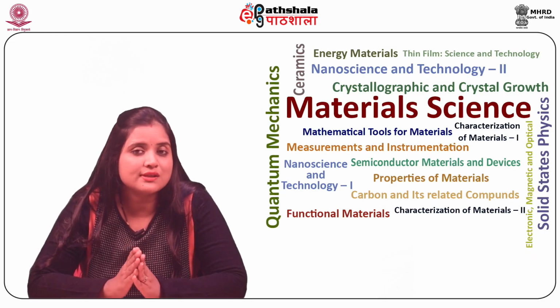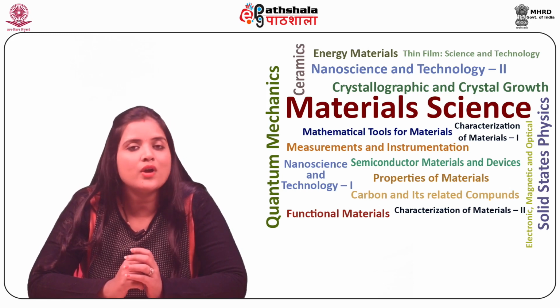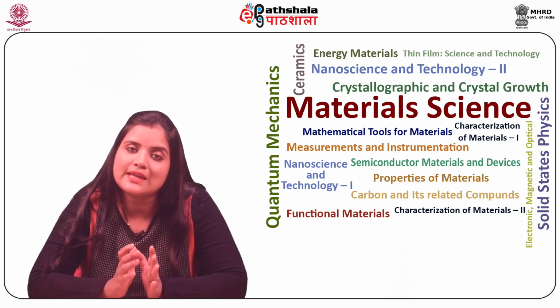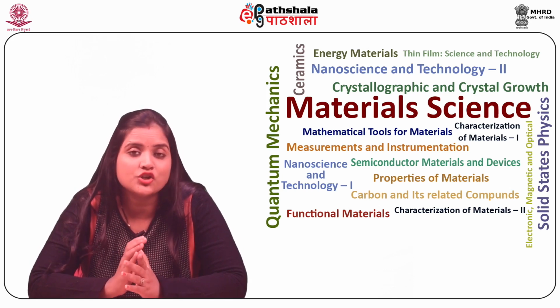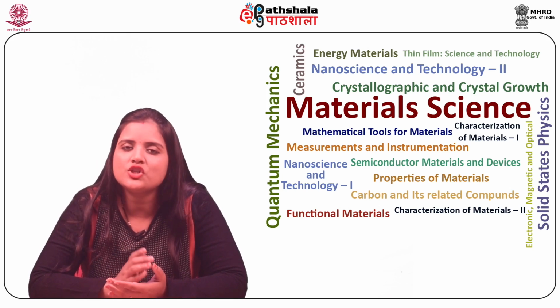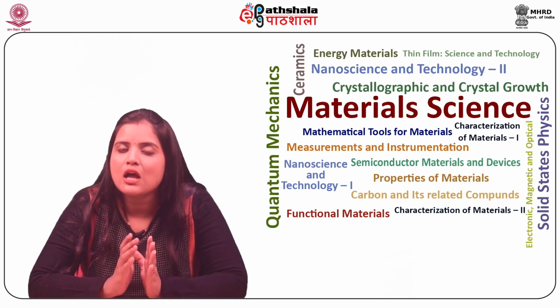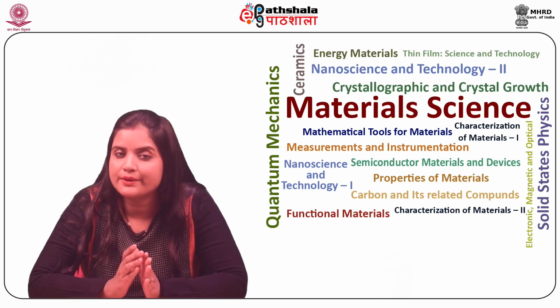Let us now discuss the applications of DHM. The first one is living cells imaging. Owing to the non-invasive nature of DHM, it is particularly efficient in visualizing and quantifying biological tissues and the like.